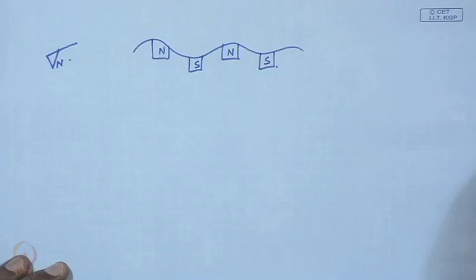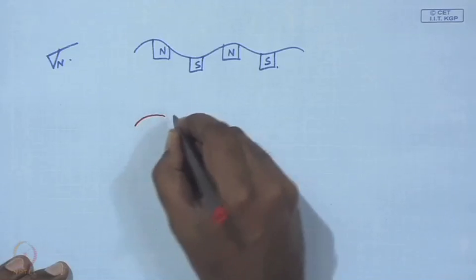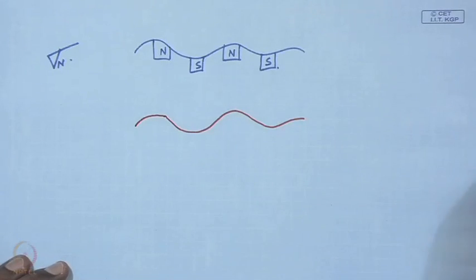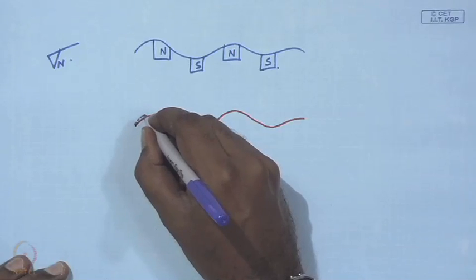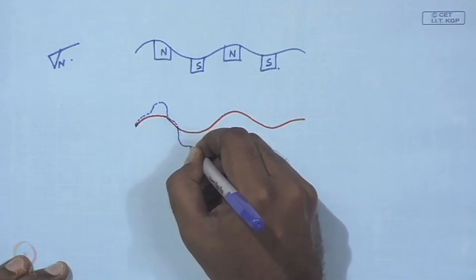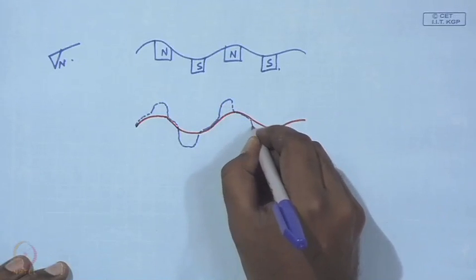So, you do a contact mode scan, and then you do a non-contact scan to find that there are certain zones where it is deviating.